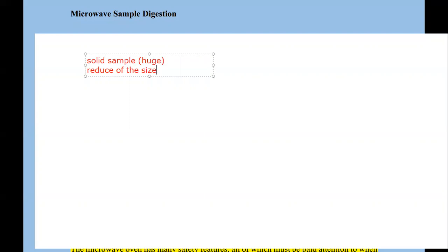In simple or secondary school laboratories, some samples that we deal with are very soluble even in water. Let's say you want to analyze the nutritional content of powdered cassava. Just get that cassava and soak it in water to make a liquid sample. But some of these rocks that we work on in the industry, let's say copper, you can't just get copper and dissolve it in water when you're trying to prepare an aliquot. It's not possible. So different methods, of course, are likely to be applied.